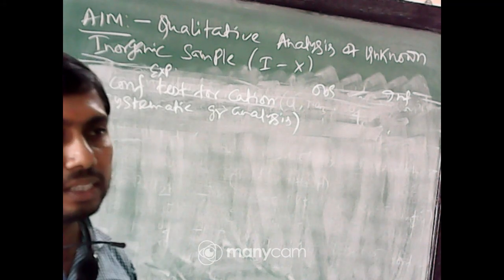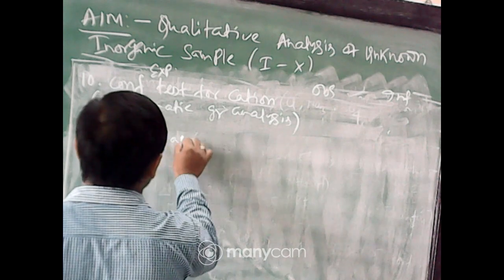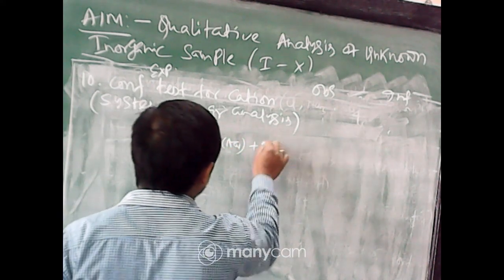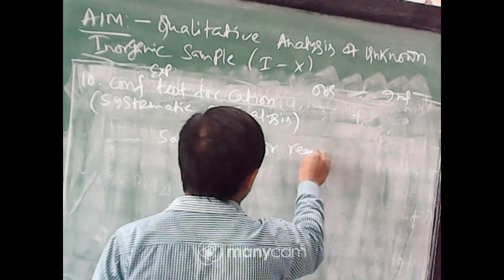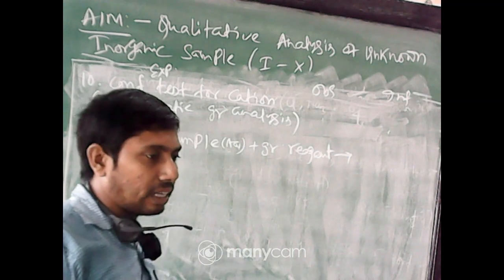Now this group reagent gives a PPT. Suppose a sample, the aqueous solution, plus group reagent. The group reagent gives that PPT, which will be deposited at the bottom.